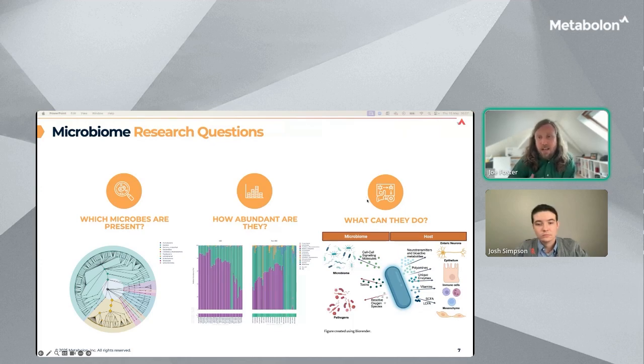Understood by either interrogating the identified microbes' reference genomes in public databases, or in the case of shotgun sequencing, directly identifying genes and their predicted or known functions. Really, though, what we need to focus on here is that the genome of an organism really defines what it can do, but it leaves a lot of room for guesswork of what's actually happening in a sample.